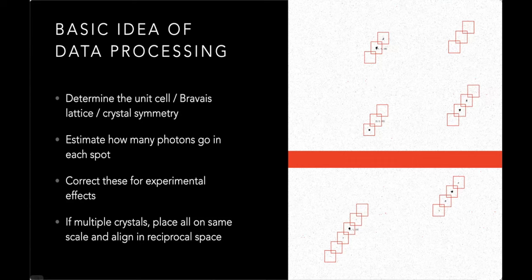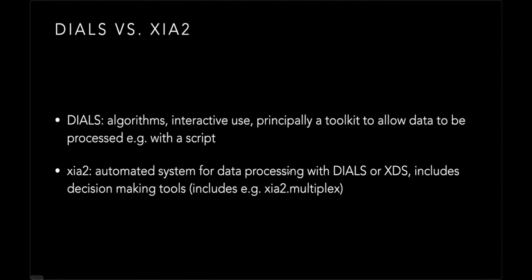If you're handling multiple crystals, then the key thing is, before you try and place them all on a common scale, you need to align them in reciprocal space. That's basically the only real gotcha between doing regular data processing and multi-crystal data processing. And this is really where I'm going to focus most of the attention.